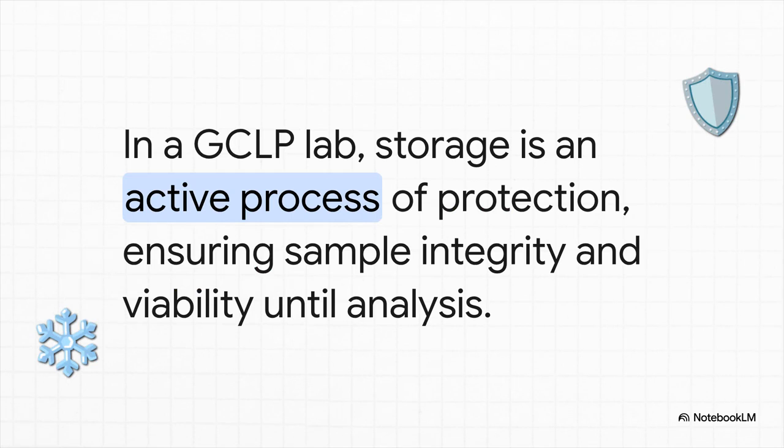So once a sample is properly identified and checked in, it goes into storage. But in a GCLP lab, this isn't just about sticking a tube in a freezer and walking away. No way.